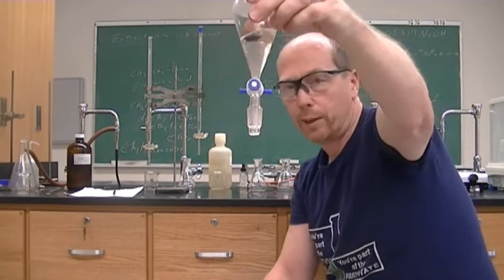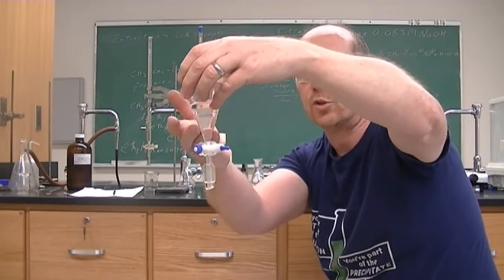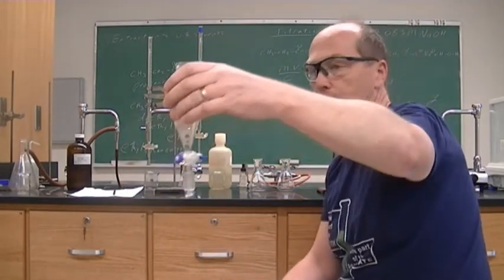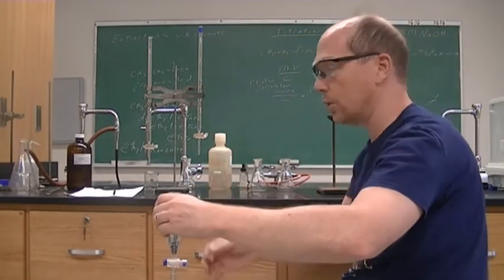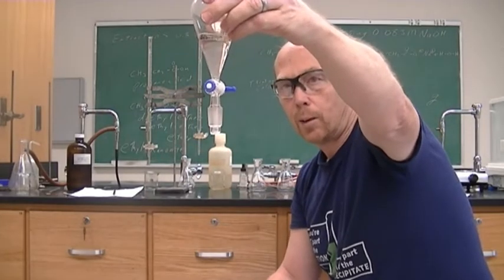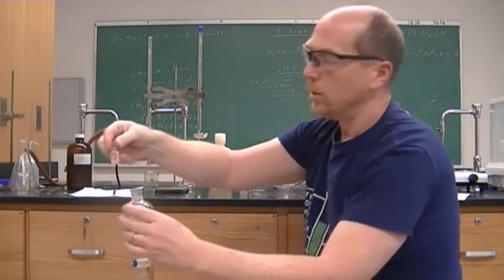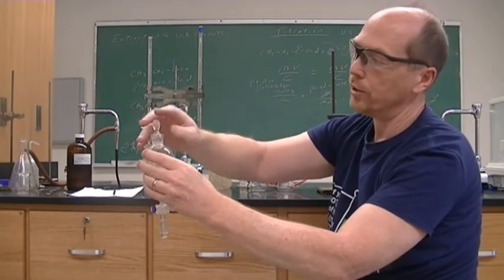But we need to make sure that this mixes up. We want the ether to extract and remove the propanoic acid from the water. Your ether is very volatile. It evaporates quickly. I spilled some on the desk, and it was gone a long time ago. When I seal this, it's going to build up pressure because of the evaporation. This is where it gets a little tricky. I'm going to seal this. Now it's in a sealed container.